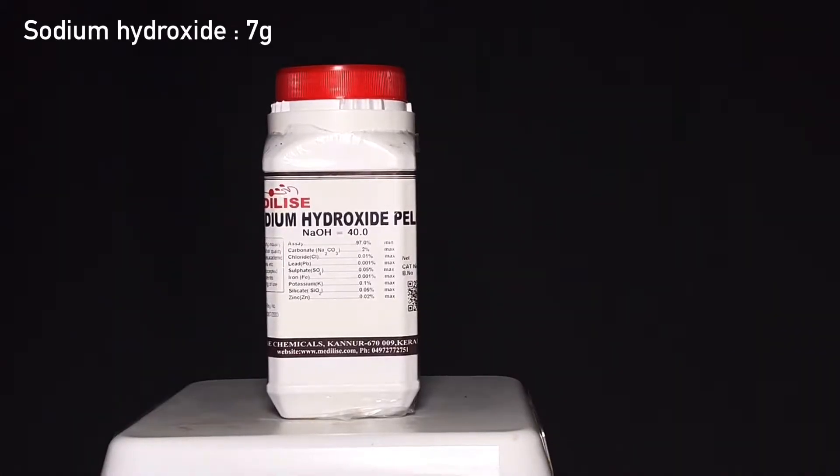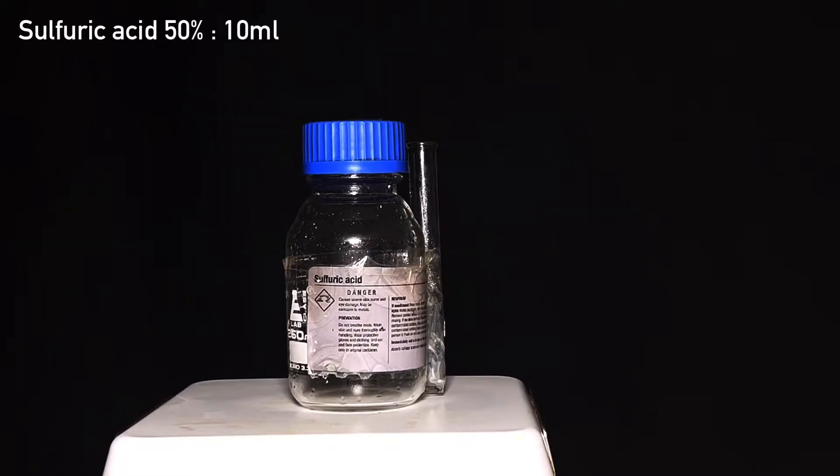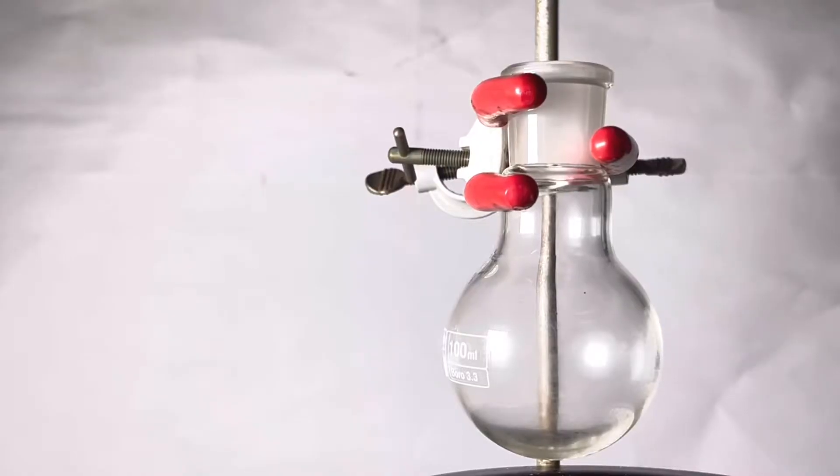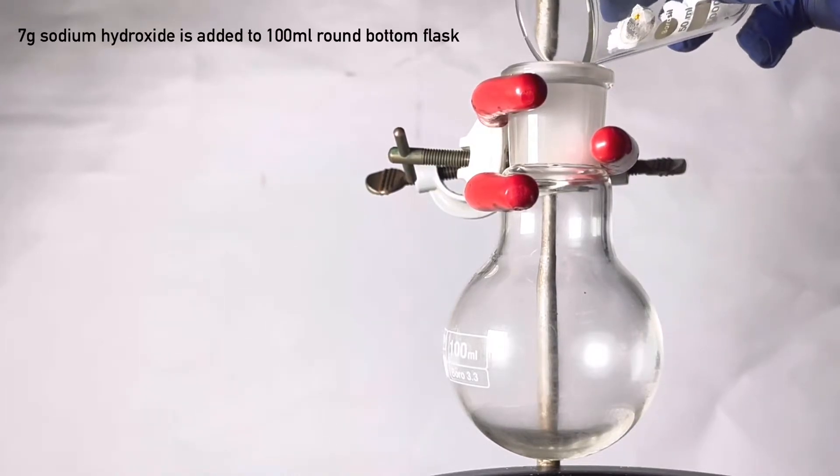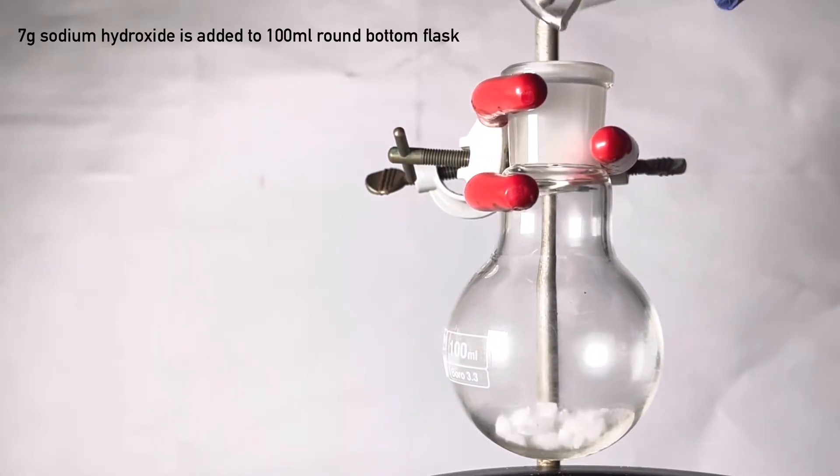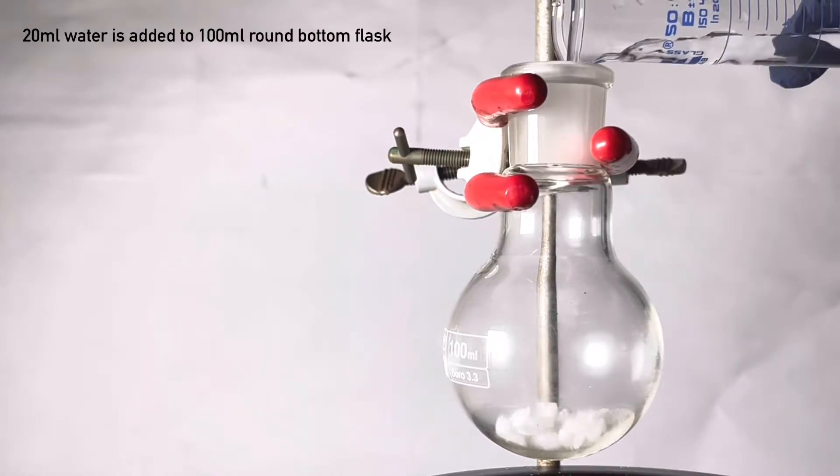7 grams of sodium hydroxide and 10 milliliters of 50% sulfuric acid. Start by taking a 100 milliliter round bottom flask and transfer 7 grams of sodium hydroxide to it. 20 milliliters of water was added to dissolve it.